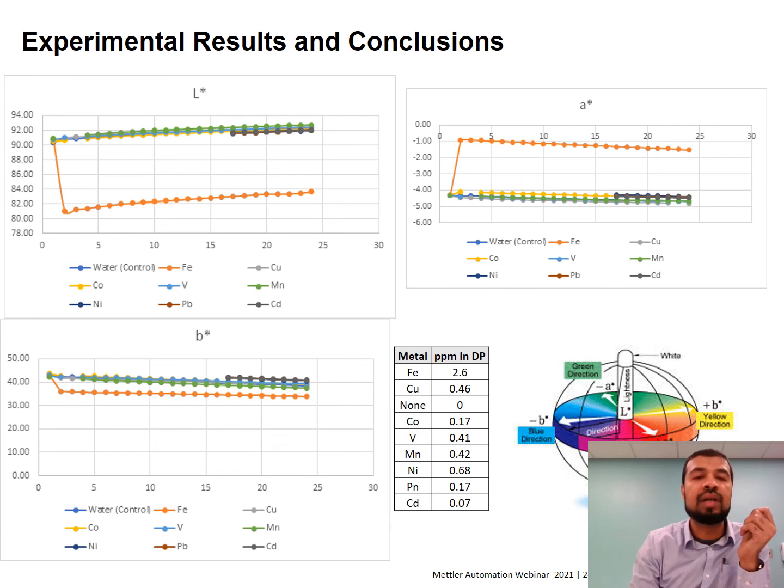Now this whole automated experimentation basically allowed us to develop the control strategy for various parameters on a drug product solution in a rapid manner, and we were able to include this control strategy in our recent filing.